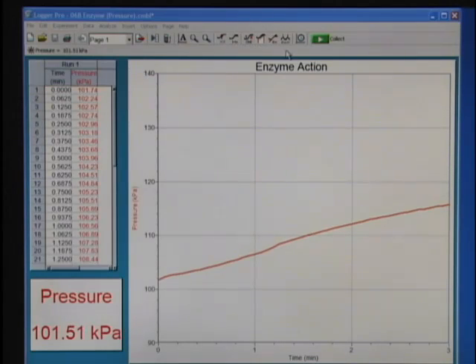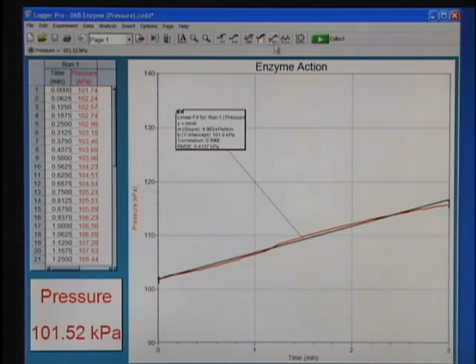To do this, click on the linear fit button on the toolbar. Record the slope of this line in your data table.